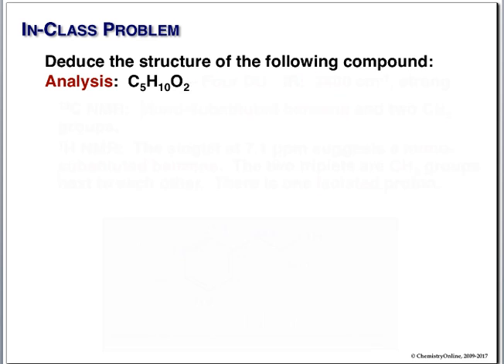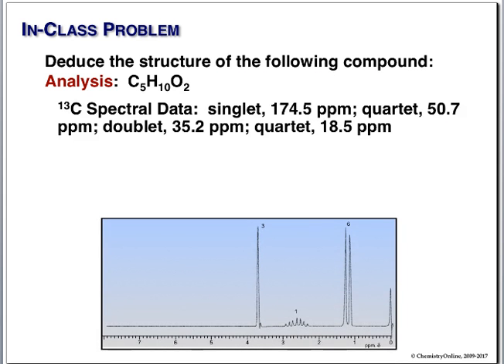Couple more. Now this one should be screaming at you already, just looking at the spectrum. We have 5 carbons, 10 hydrogens. We should have 12. That's 1 degree of unsaturation, right? We have 2 oxygens, probably looking at a carbonyl. That's a guess.